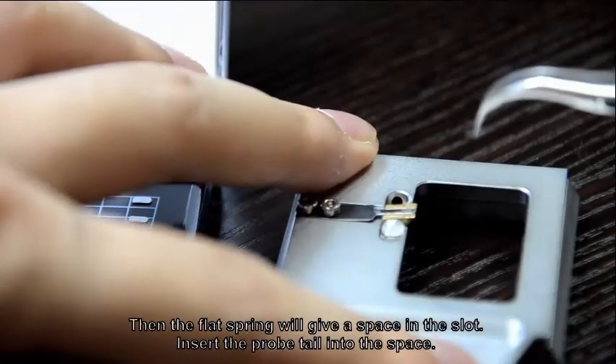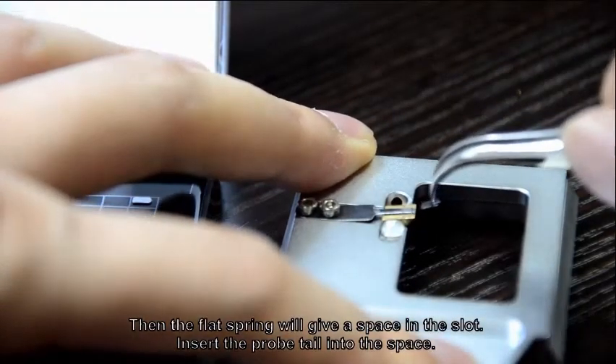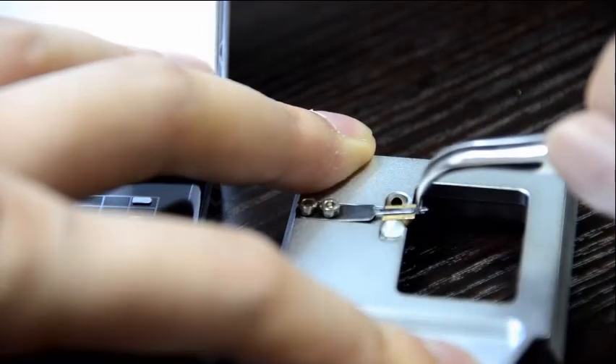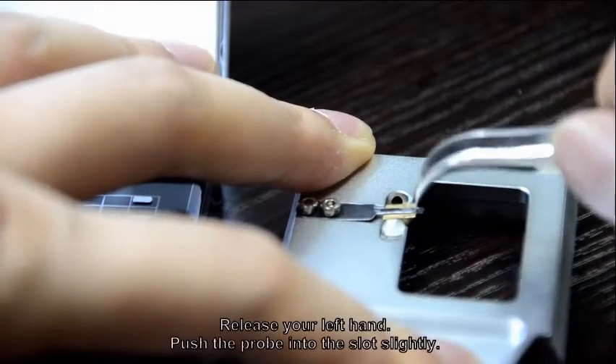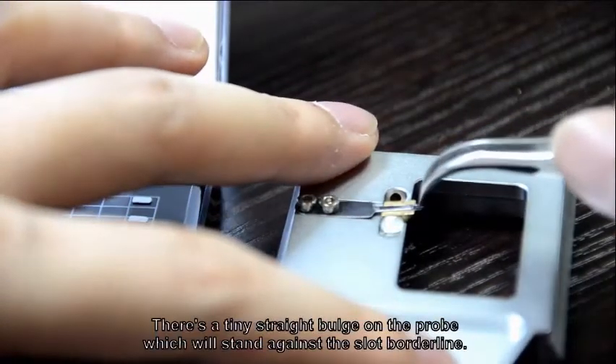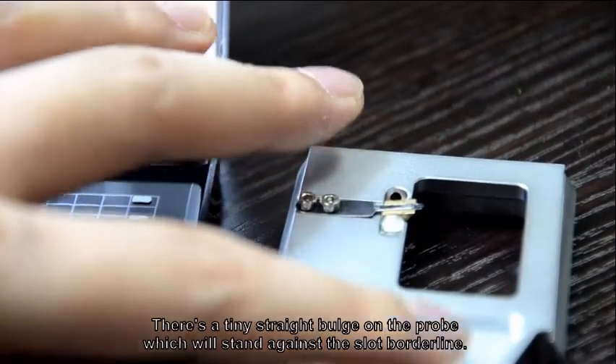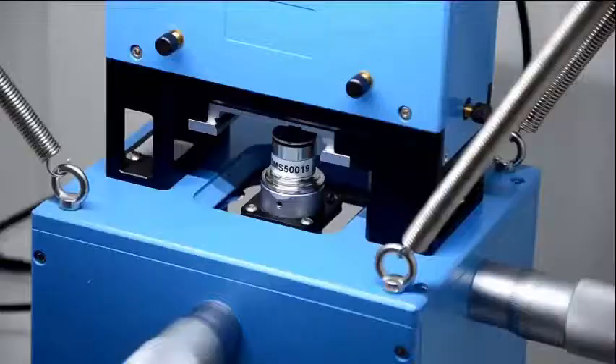The flat spring will give a space in the slot. Insert the probe tail into the space. Release your left hand, then push the probe into the slot slightly. There is a tiny straight bulge on the probe which will stand against the slot borderline — stop pushing if you can't go further.